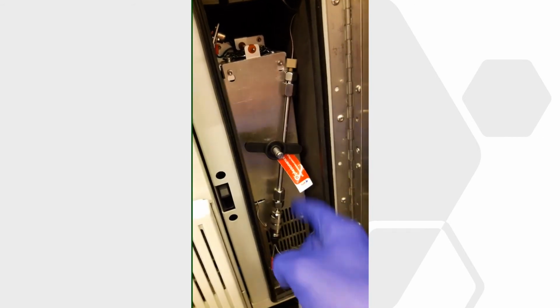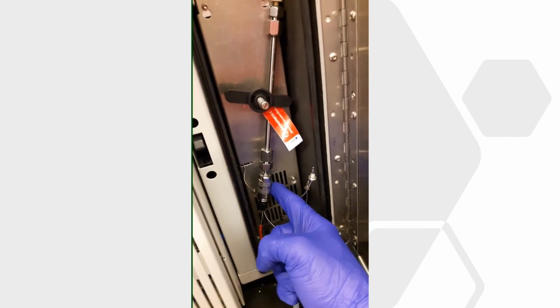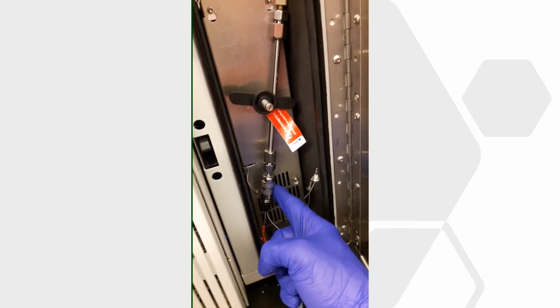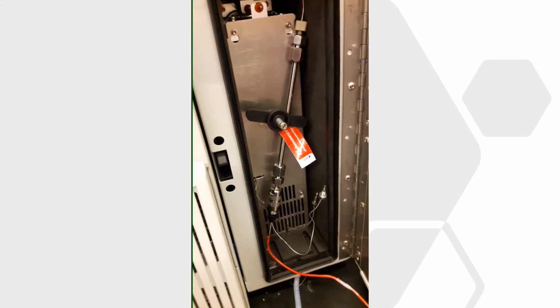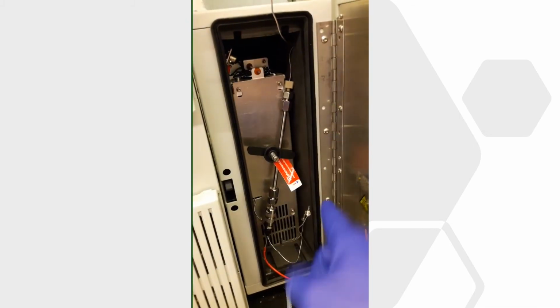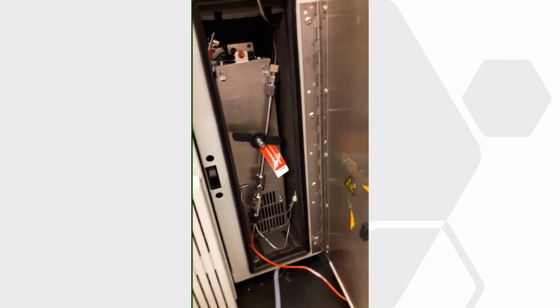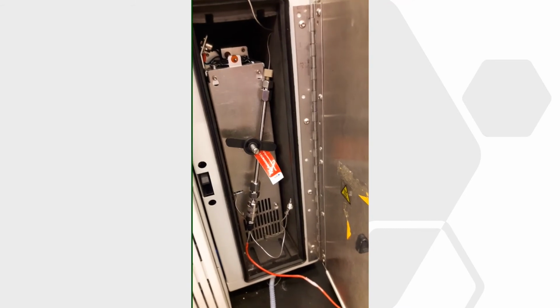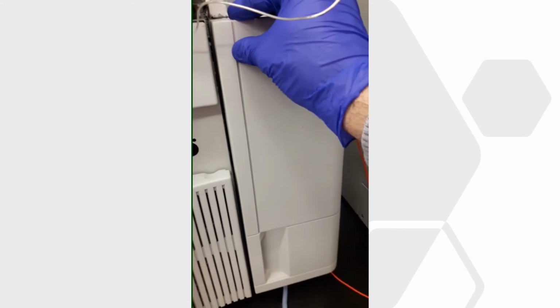Before passing through the column, it first passes through what we call a guard column, and this is just a filter acting to protect the column from any accidental particles that may be in the mobile phase. This, what we see here, is a column compartment, and it's temperature controlled, so we can adjust the temperature, which of course affects the efficiency of separation. And of course, before starting our analysis, we have to close the door for temperature control.